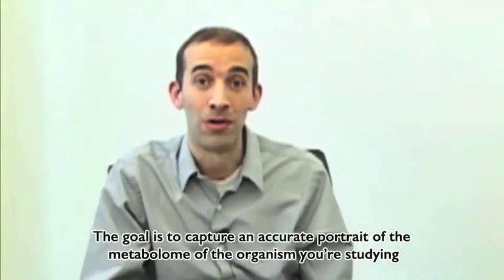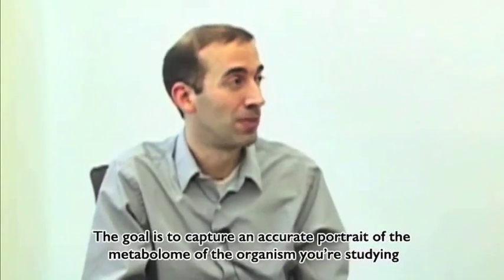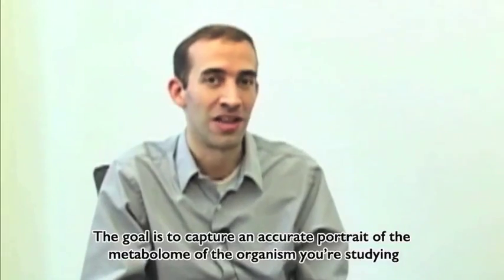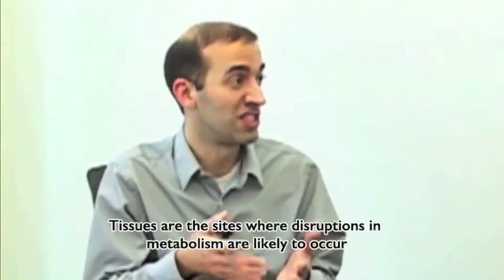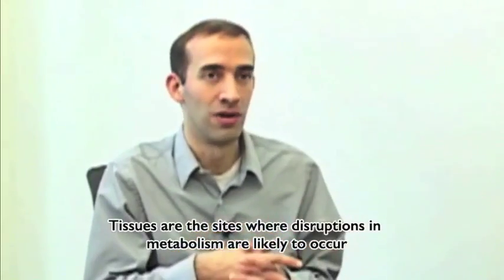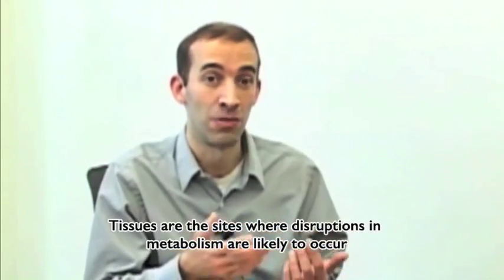Well, the goal of any metabolomics study, as you know, is to capture an accurate portrait of the metabolome of the entity that you're studying, whether it be a bacterial culture, a plant, an animal, or a human being. And the metabolome is very dynamic, and you want to capture any changes in the metabolome that occur in the system that you're studying. So in a higher organism, the tissue is the site that those disruptions may occur in, for instance, a disease or some sort of an experimental manipulation that you're performing.